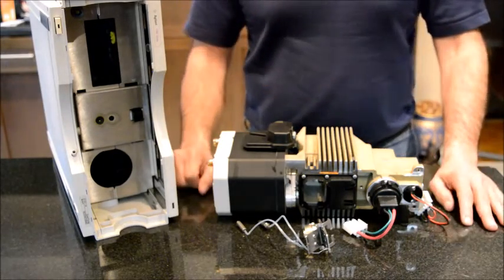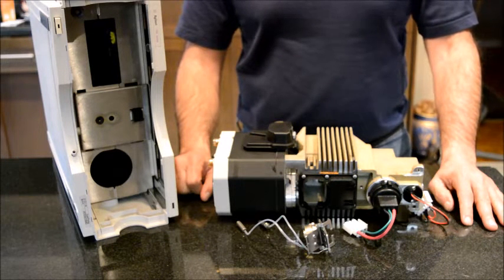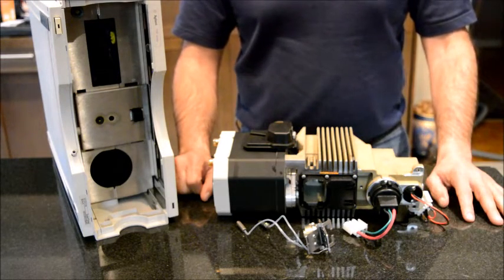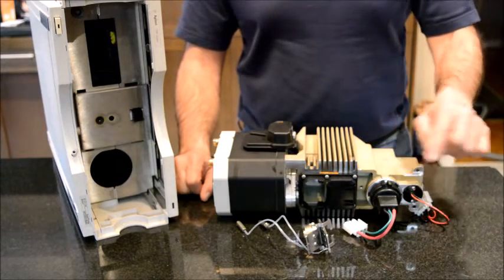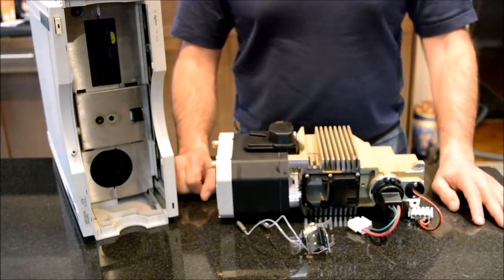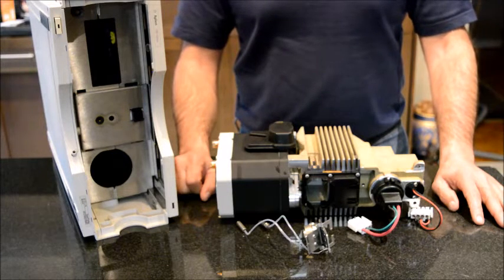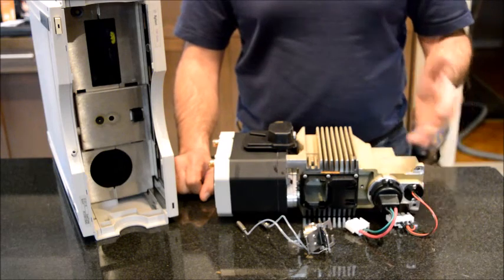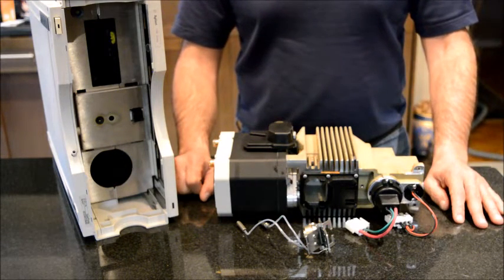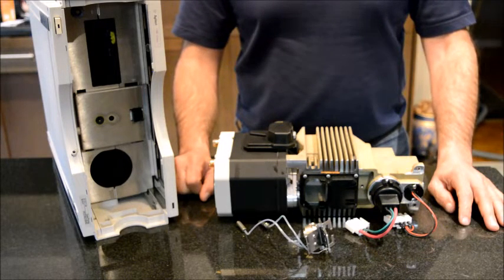I'm going to start with the lamps. I would say that probably 90 to 95 percent of detector-related problems have to do with your lamp, and more specifically with your deuterium lamp. The deuterium lamp will not last forever. Usually they say it needs to be replaced every 1000 hours of operation, and depending on how often you use your detector, it will probably last about one year. These deuterium lamps also have a shelf life, meaning that if you buy them and stockpile them, they will go bad.